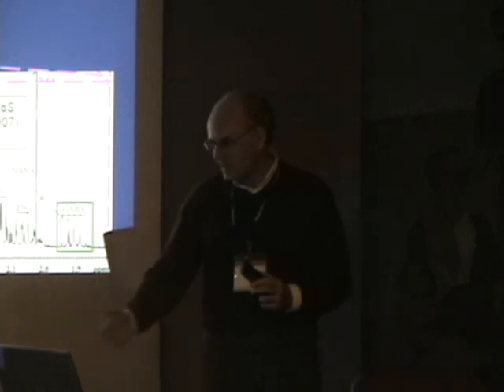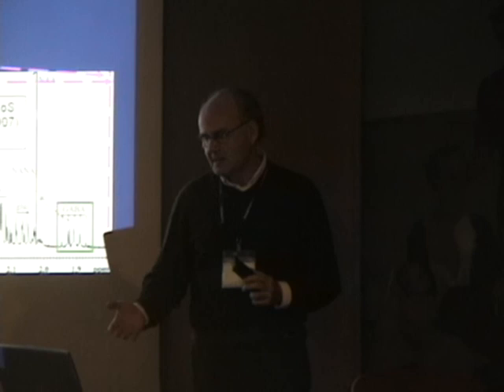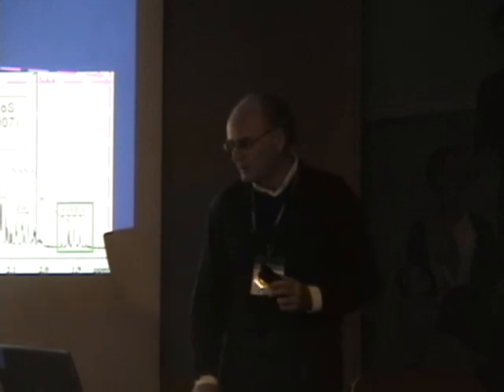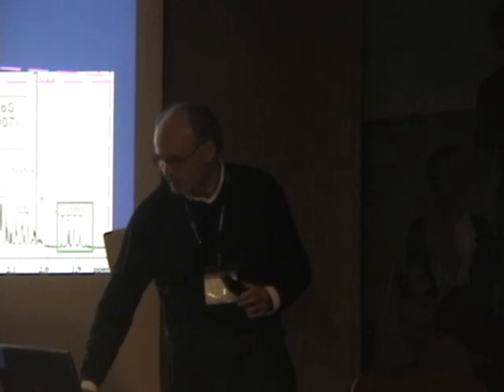You see a lot more peaks, GABA peaks, even an acetate peak. These are all peaks, details that you would not even suspect when you look at the in vivo spectrum. Another spectral region is here, the glutamine-glutamate region, which does not give a well-resolved peak in vivo. Here at long echo times it looks like that. That's not impressive either.